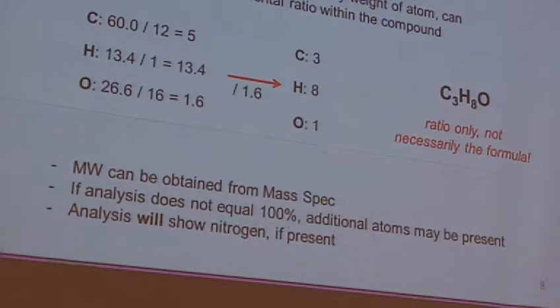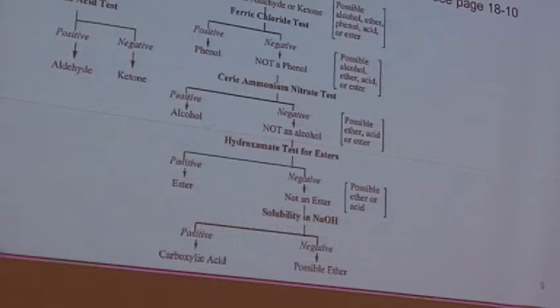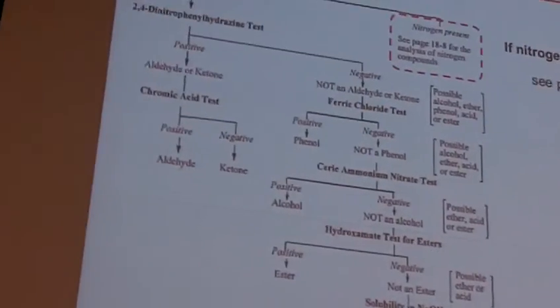So long story short, that will tell you if you have nitrogen. So what I would suggest is for the first step tomorrow or Thursday when you do the lab, just simply look, do you have nitrogen, yes or no? And then move on. You can do the analysis as you have a little downtime or once you get a little bit more information together. Okay? All right. Okay, so moving forward.